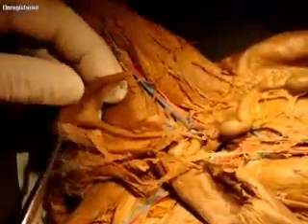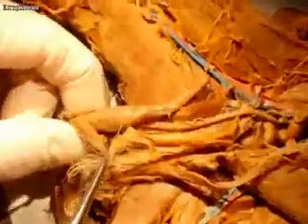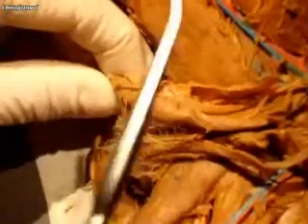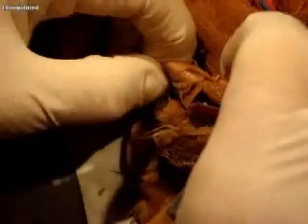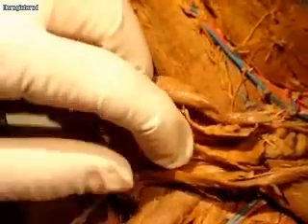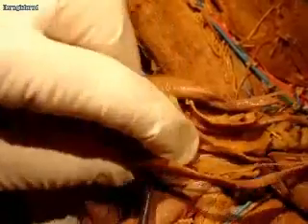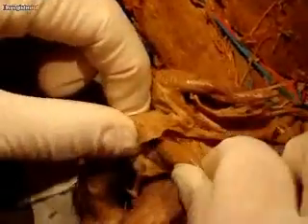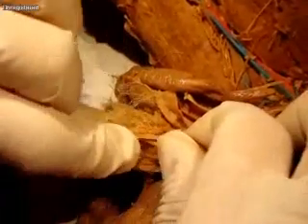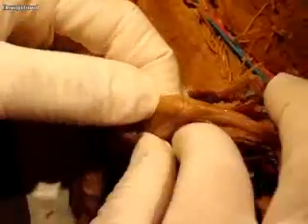So looking at the male reproductive system, you've got this... are we out of view? I've got a little scrotum in my hand. Did you pull any of these out? Are any of these pulled? Is this one pulled all the way out? So I'm pulling the testis out of the scrotal sac, or trying to.